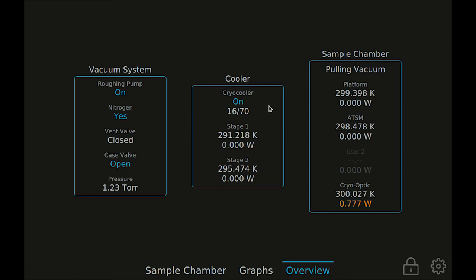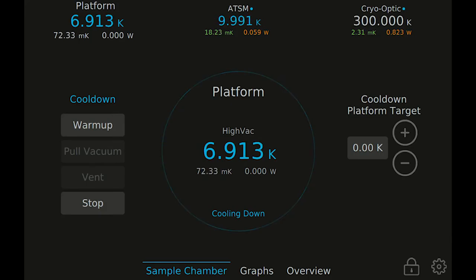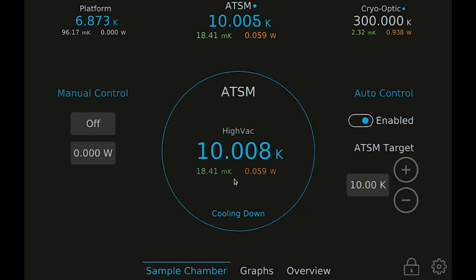The temperature graphs are also a good way to monitor the progress of the cool-down. The system is now cold and the ATSM has reached the target temperature. Press the ATSM temperature channel to return to the ATSM temperature controls. The temperature stability of the ATSM is displayed in the center of the screen along with the heater power being applied to maintain that temperature.